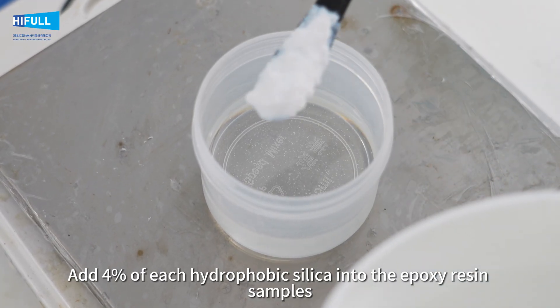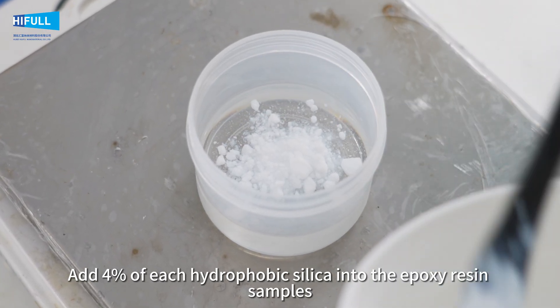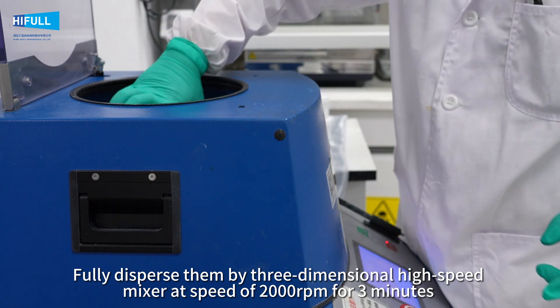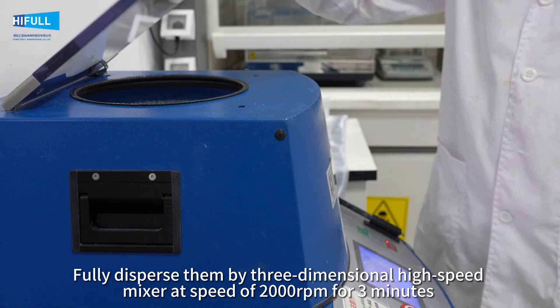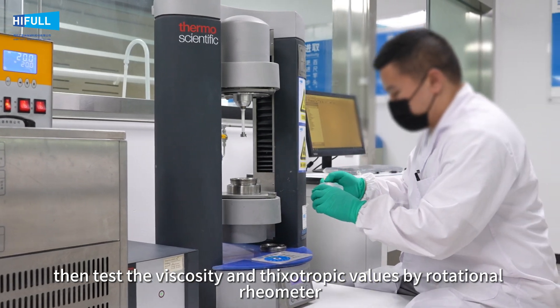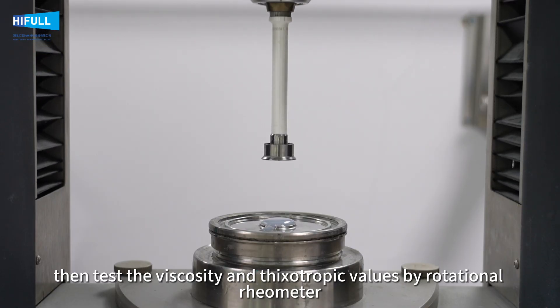Add 4% of each hydrophobic silica into the epoxy resin samples. Fully disperse them by 3-dimensional high-speed mixer at a speed of 2000 rounds per minute for 3 minutes. Then test the viscosity and thixotropic values by rotational rheometer.